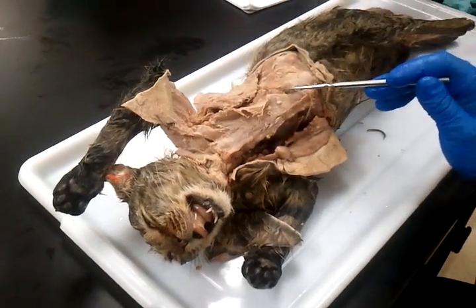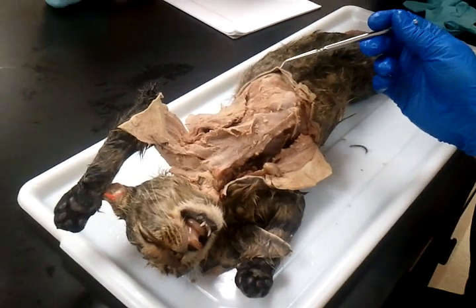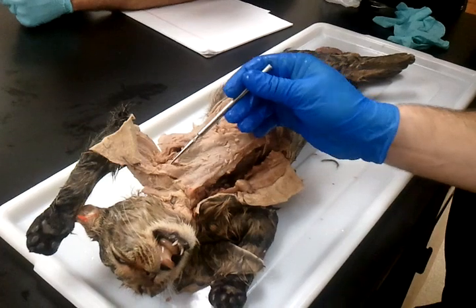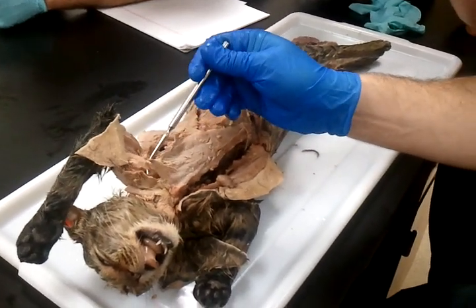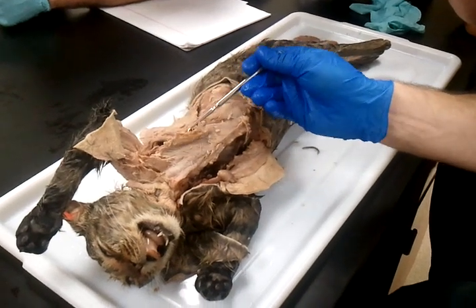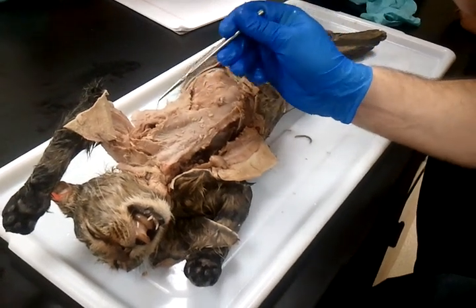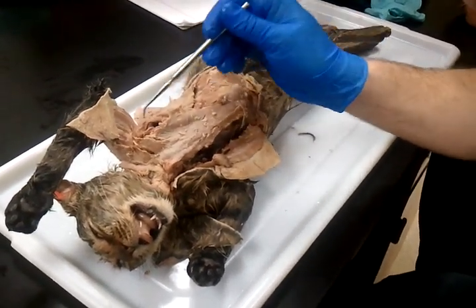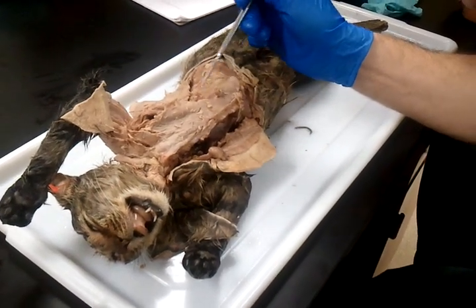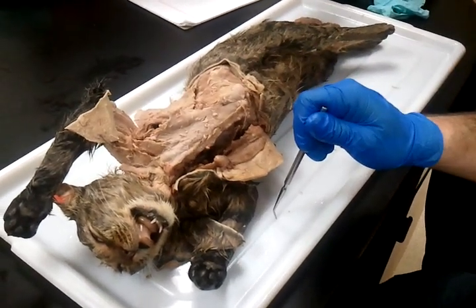Okay. Sorry, can you repeat that? My camera stopped and I want to know what that is. Pecto antebrachialis. Yeah. Pectoralis major. Pectoralis minor is the bigger one. And this piece here, which would normally go up to here, is xiphihumeralis because it goes from the xiphoid process to the humerus, and it was just cut. So it would have been there. Thank you. Okay. Yours is perfect.